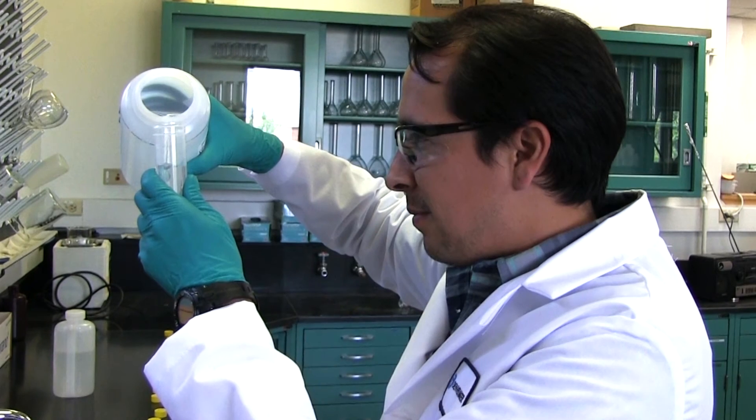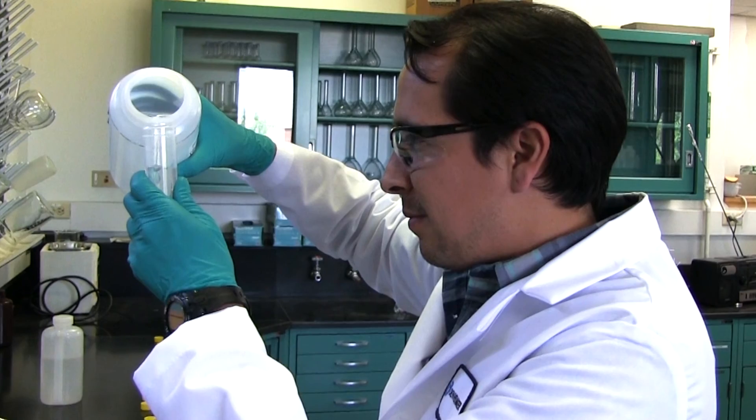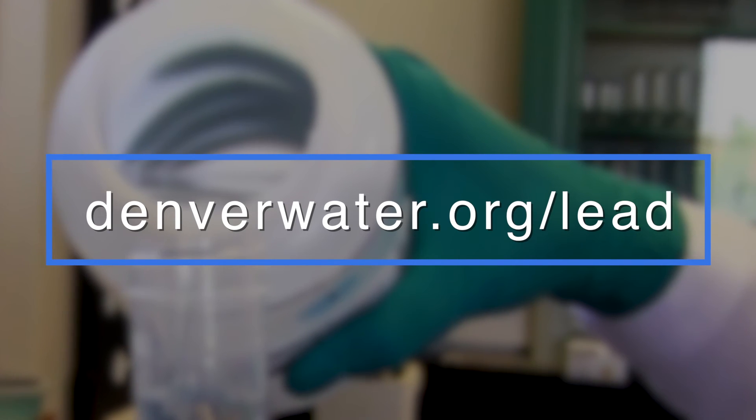Denver Water will send the test results to you within about four weeks, along with information on steps to reduce the risk of lead in your drinking water. You can find more information at denverwater.org/lead.